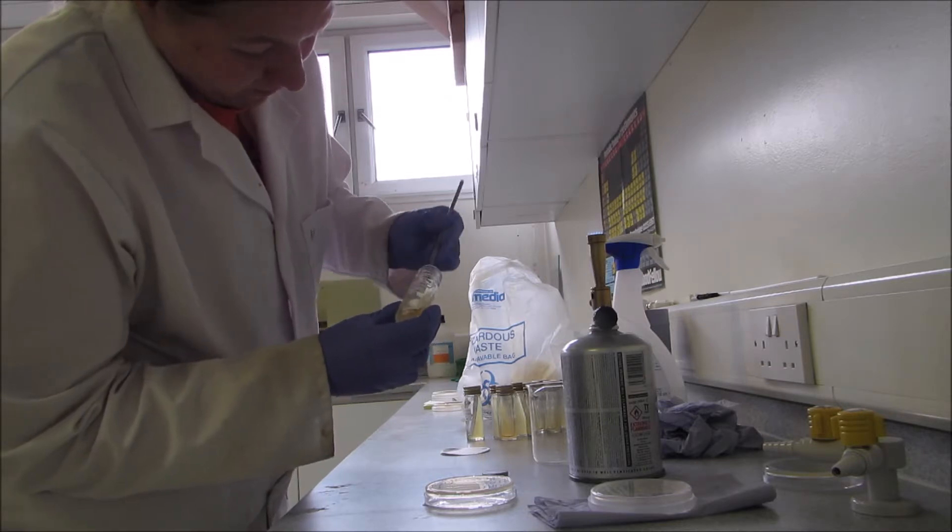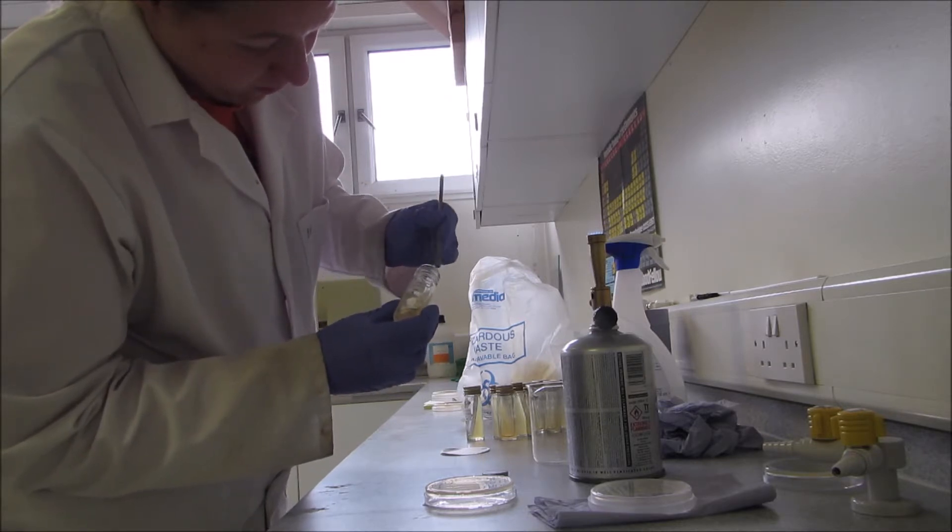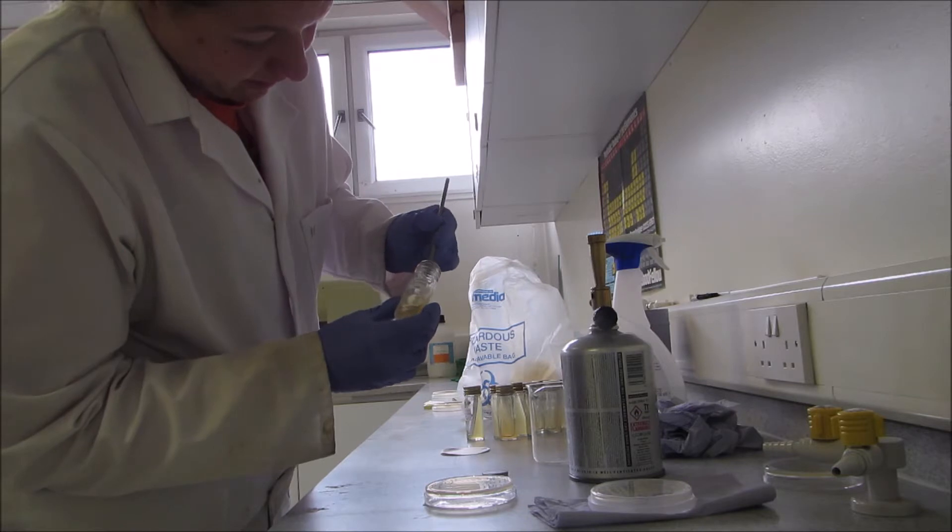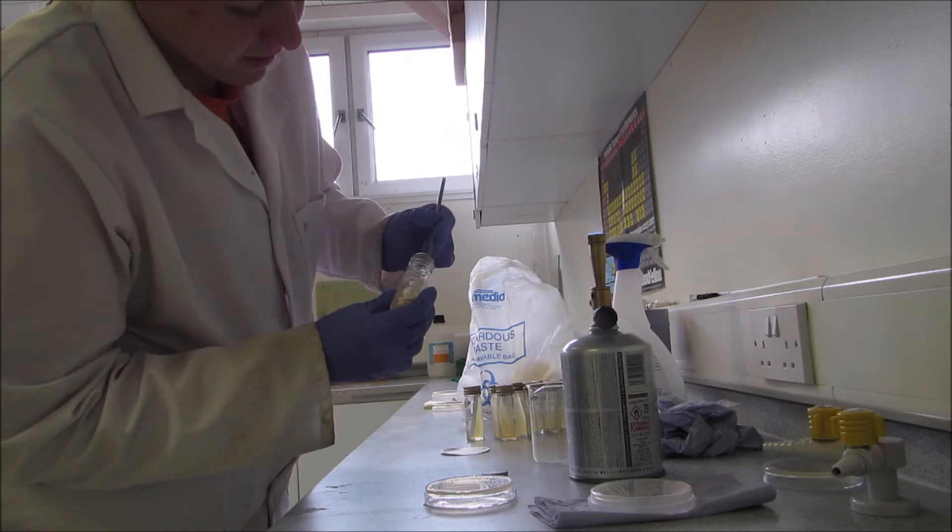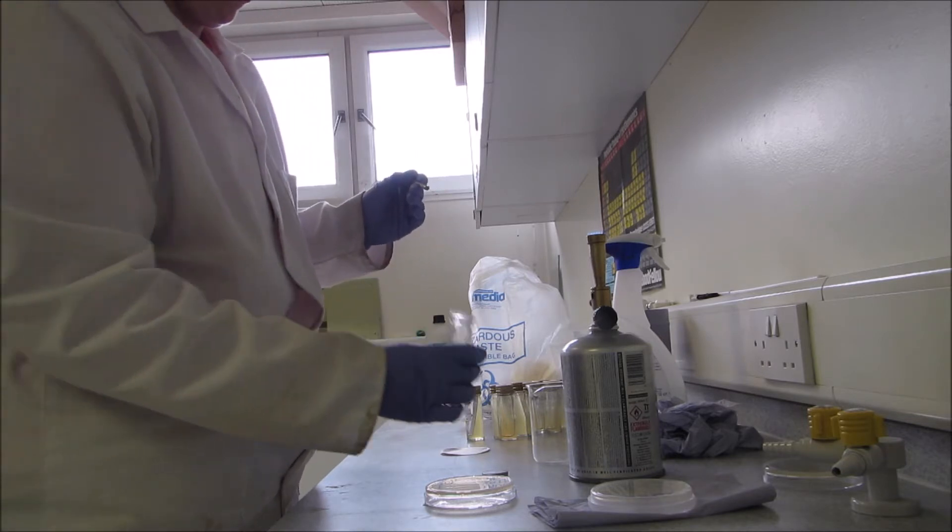And you can also do a few more. The aim is to get it so the whole plate is covered like a lawn, so that you can't pick out single colonies. And then this can be used as a stock bacteria to produce single colonies again.